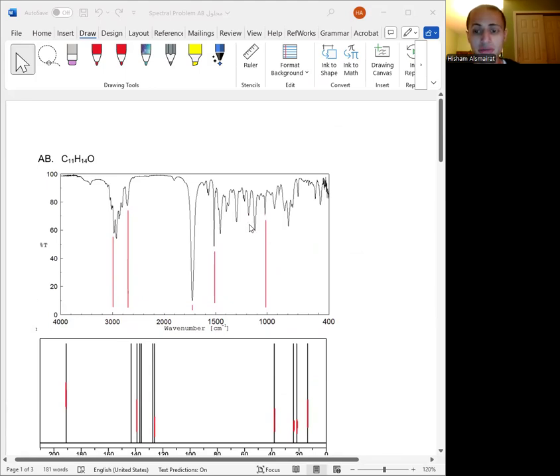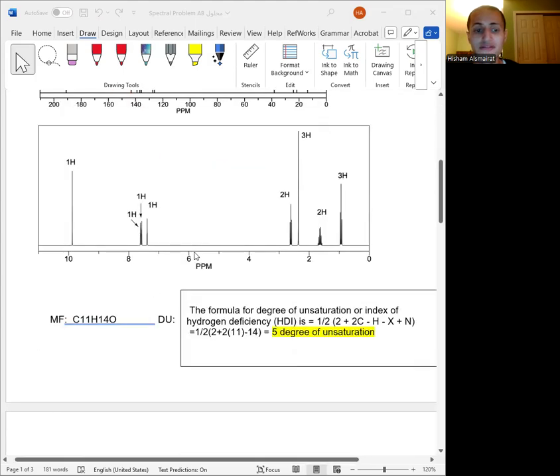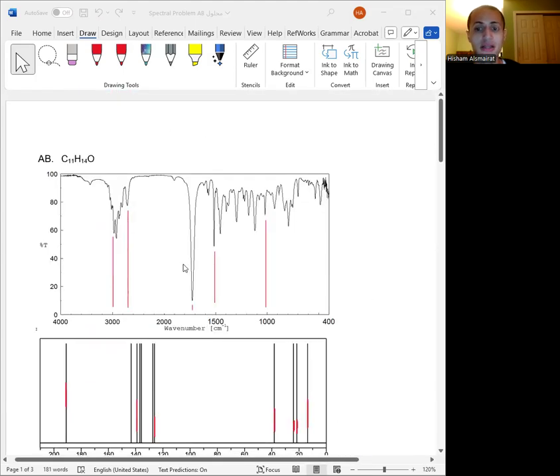My IR table has two columns, a frequency and functional groups. And here's exactly how I filled each entry. I first scan the 3100 to 3000 region. As we see, a band near 3030 tells us there are sp2 C single bond H from an aromatic ring. So I typed 3030 in the frequency column and wrote aromatic C single bond H stretch in the functional group.